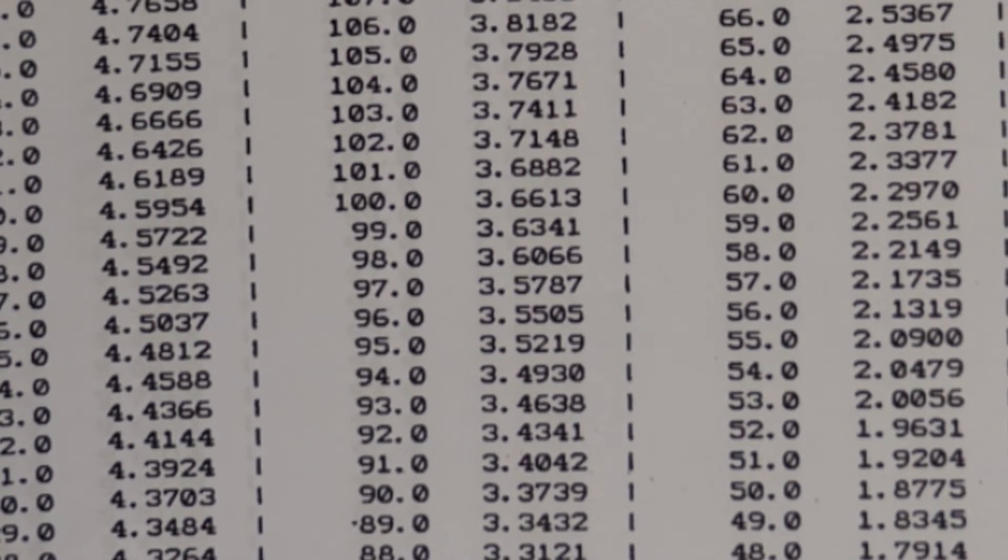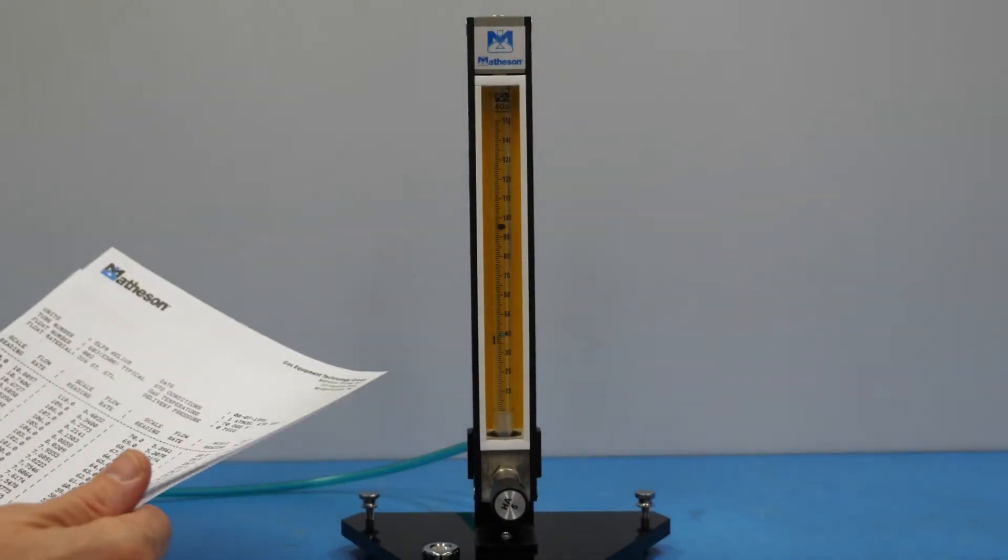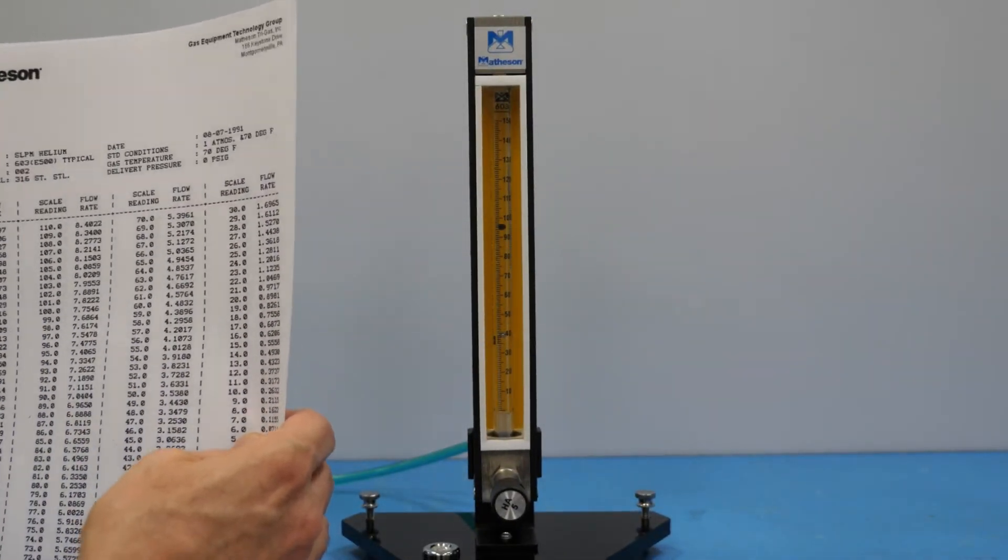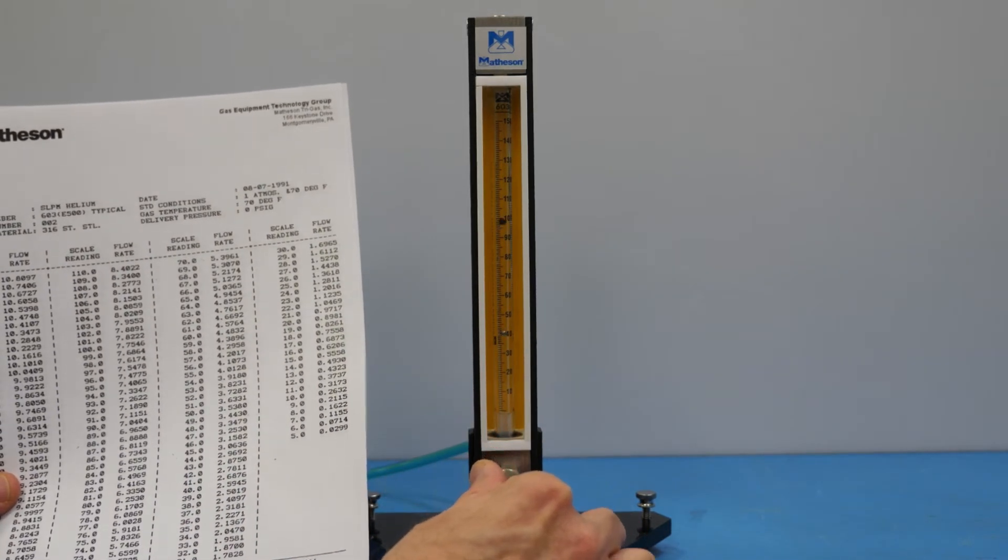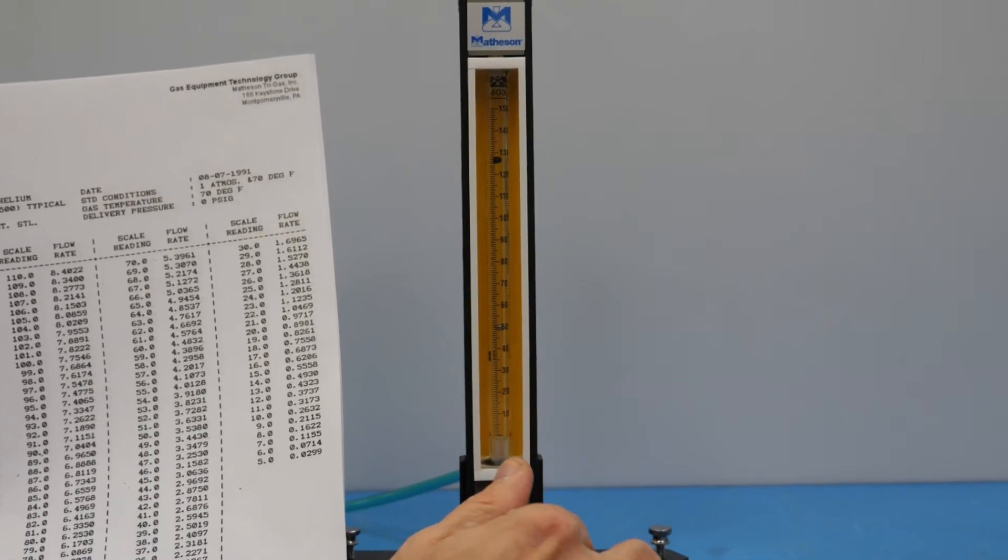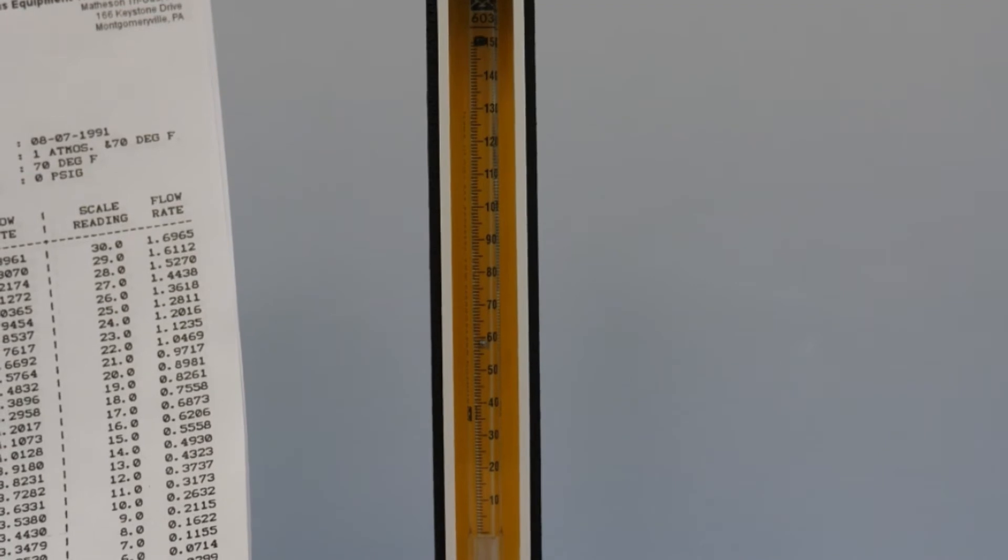At this point I'd like to demonstrate how you would read the stainless steel float. We begin to read the stainless steel float once the glass float has risen above the measurable range of the meter.